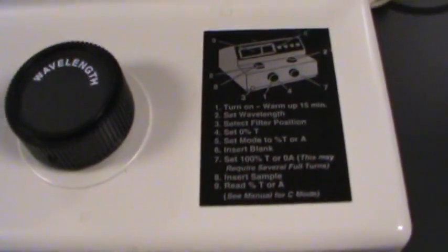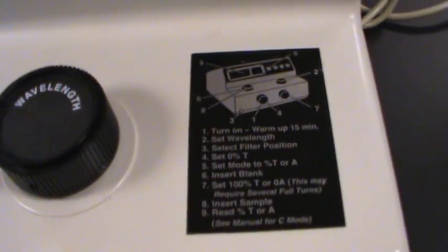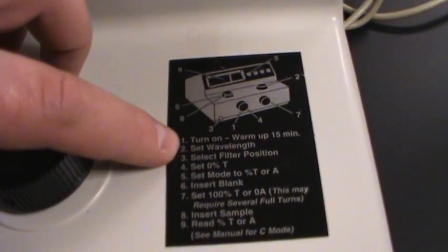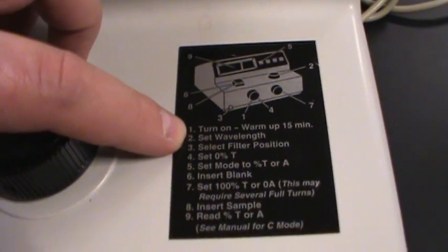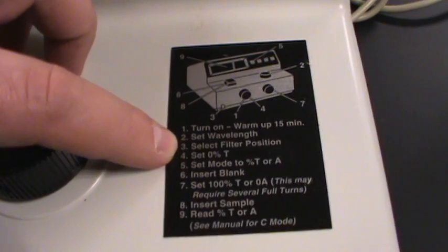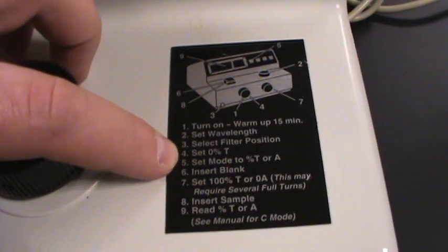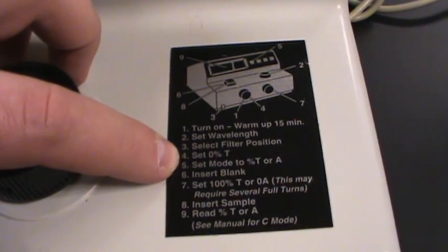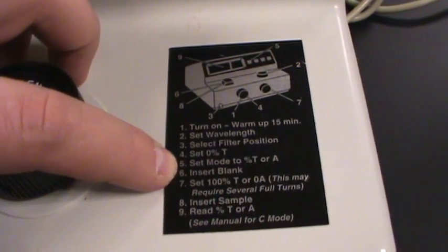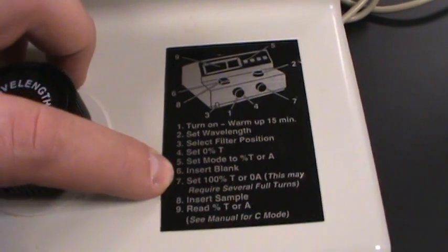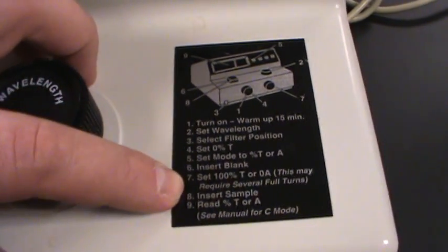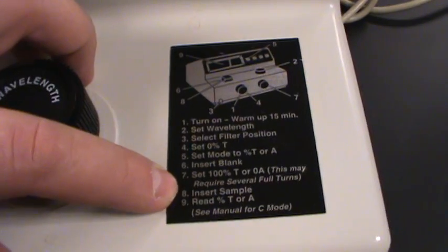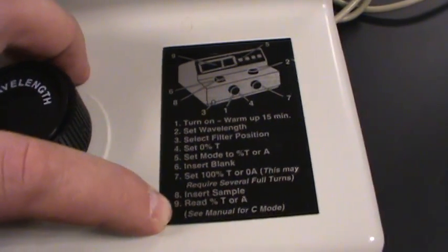Now what does it tell us to do? It tells us turn on and warm up 15 minutes, select wavelength, select filter, set zero percent transmittance, set mode, insert blank, set 100 percent transmittance, insert sample, and read.